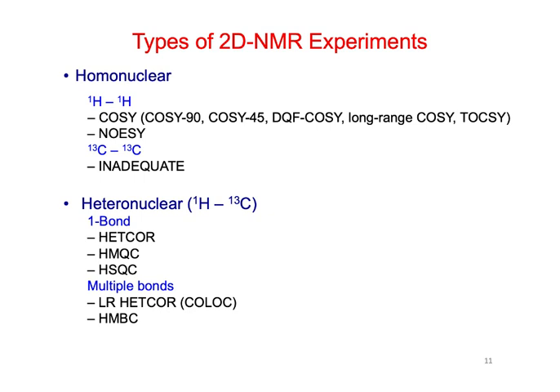Right, but I think the NMR of those big molecules like that, I'm sure some of it is probably even more automated now. But those spectra are so complicated. If you just look at the one-dimensional spectrum, it's just like this, right?